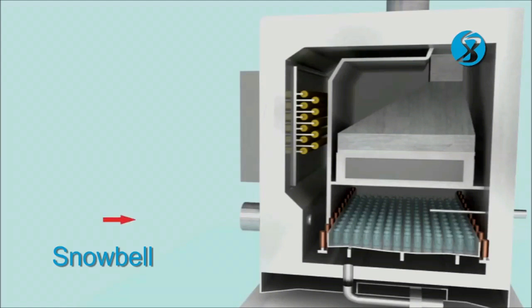Due to a positive differential in the heating zone, a small amount of air flows to the drying and cooling zones.